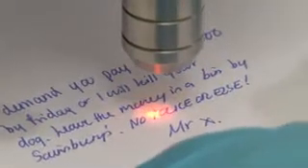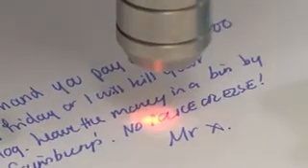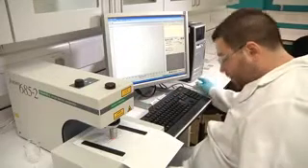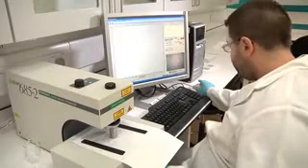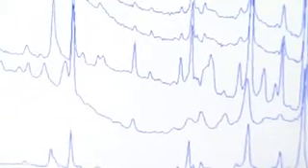One method that I have been looking at in detail is Raman spectroscopy. This is a scientific technique that directs a laser light of a specific wavelength through a microscope onto ink on a document. As the laser light interacts with the different chemical bonds that make up the chemical structure of the ink, some radiation that has shifted to a longer wavelength of light is scattered from the surface of the ink and collected through the microscope. This radiation passes through the microscope and into a spectrometer, where it is detected and the information it contains converted into a visual display on a computer screen.